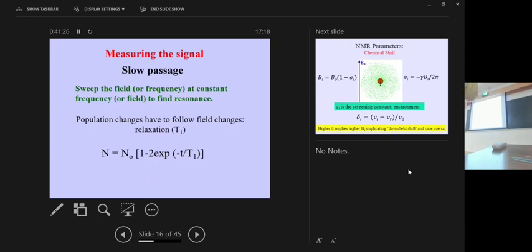Depending upon the amount of current you pass, you generate a magnetic field. It is easy to change the current, so therefore you can easily change the magnetic field. So it was conveniently done at that time. It was convenient to use an electromagnet and therefore you have to scan through the field, and how fast you should do it?